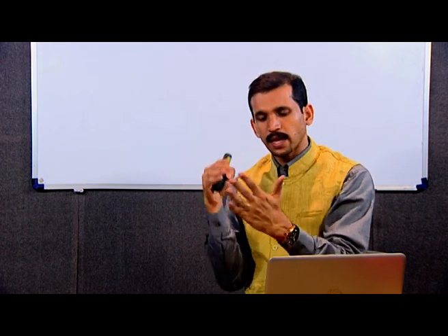The target is made of the materials we listed, the 5 different source materials. These electrons strike the target, and the target releases X-rays. The radiation coming out is termed by a German word, Bremsstrahlung. Bremsstrahlung is a German word meaning braking radiation.